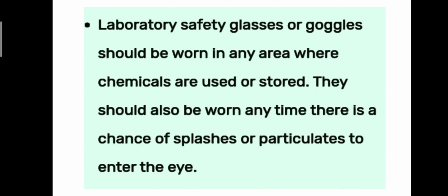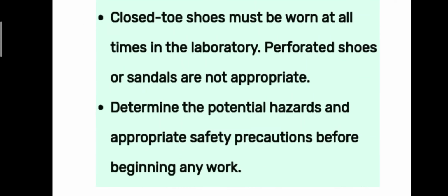Laboratory safety glasses or goggles should be worn in any area where chemicals are used or stored. They should also be worn anytime there is a chance of splashes or particulates entering the eye. Closed-toe shoes must be worn at all times in the laboratory. Perforated shoes or sandals are not appropriate.